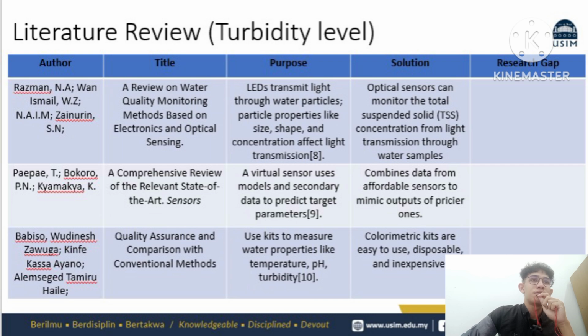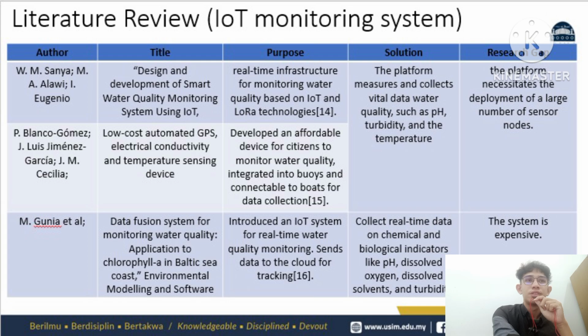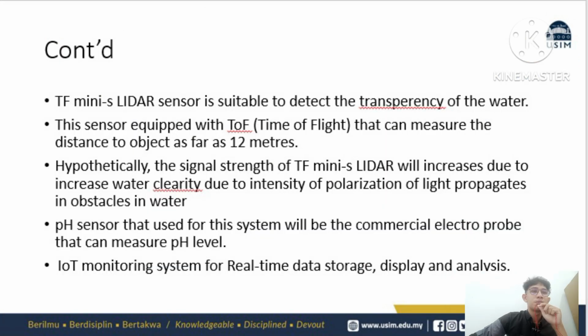Example of papers that I have reviewed and researched. So I will just go on about the turbidity level that has been checked, pH level, and also IoT monitoring system.